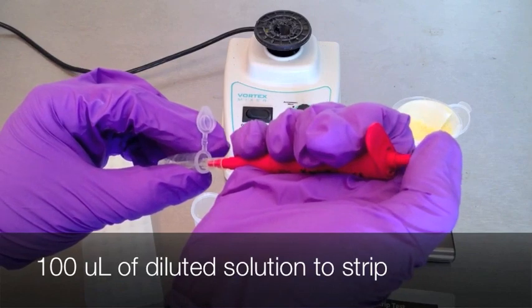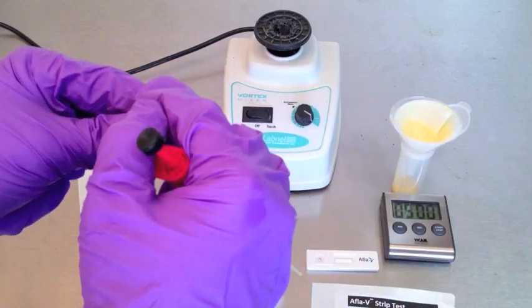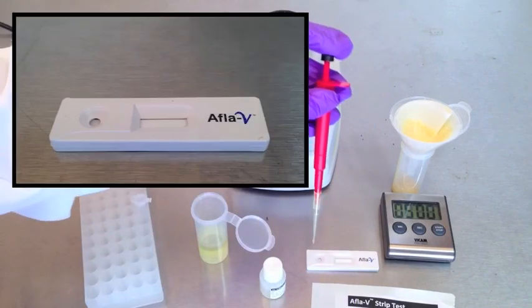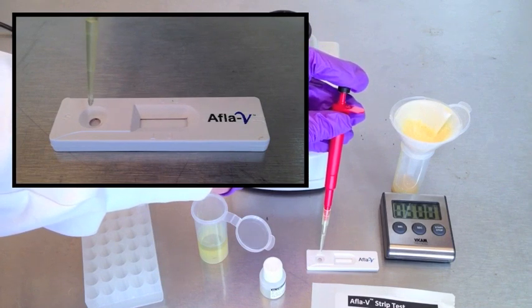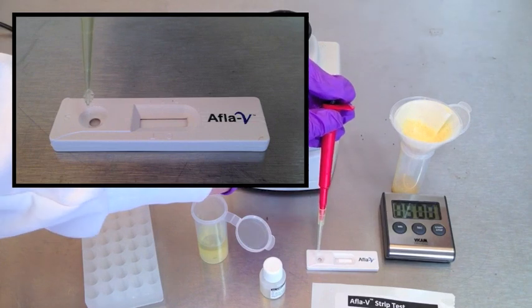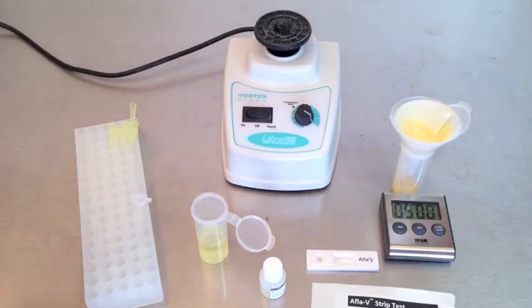After vortexing, transfer 100 microliters to the well in the AFLA-V strip test. Drop vertically, approximately one drop per second, into the circular opening.